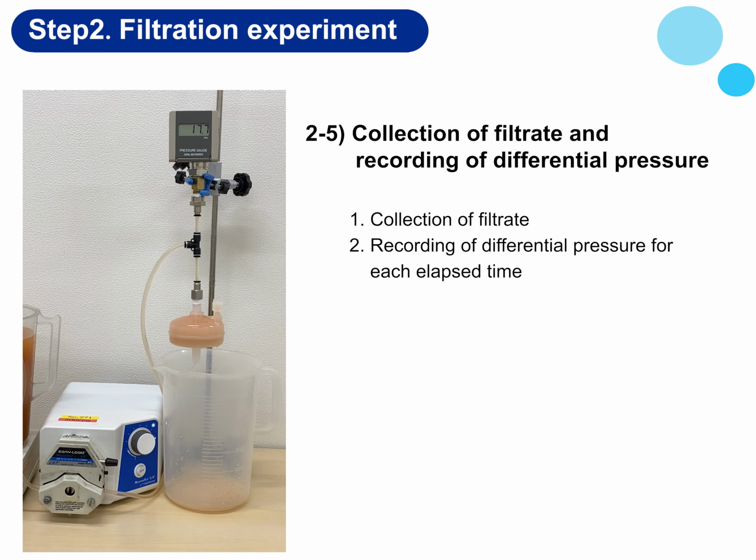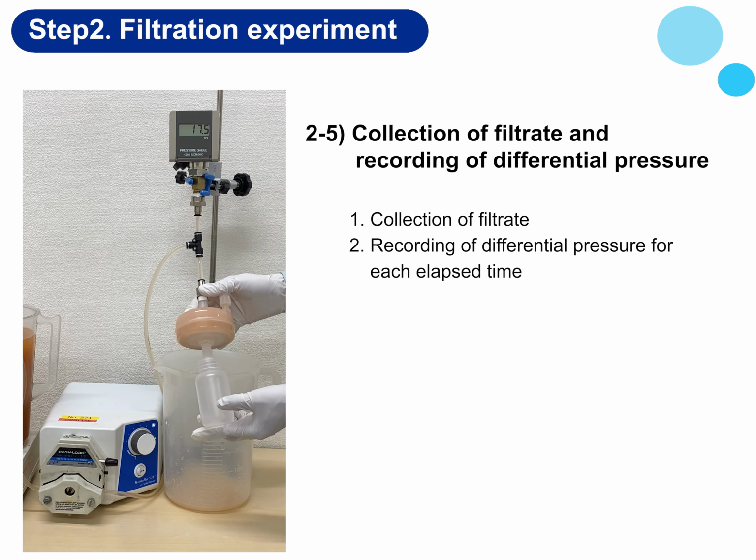From here, we proceed to collect filtrate and record differential pressure at predetermined timings. After discarding a small amount of the initial filtrate flow for the purpose of flushing the entire line and expelling the solvent inside the filter during pre-wetting, the filtrate is collected.